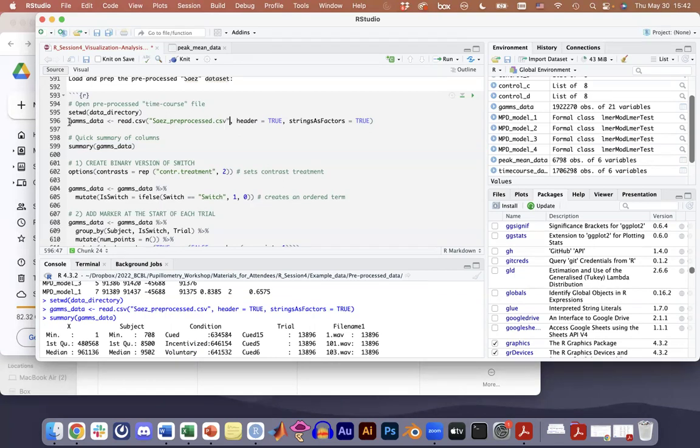But I have a very weird question. Go for it. I know that when you have the chunks in R markdown, you can run it in chunk, but if I go one by one, sometimes it doesn't like it and it wants it in chunk. Yeah, this is why I don't like R markdown. But I don't know. My answer is I don't know.